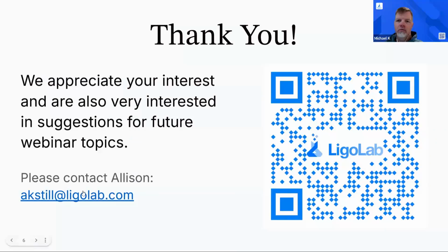Okay, and then one more for Olga. You're involved in a lot of software demonstrations. People interested in acquiring a new LIS system or launching a pathology lab inevitably are going to check in with you and your team. Just give us a sense of what you often hear when you talk to these people on those initial conversations, and what solutions are potentially there for them.